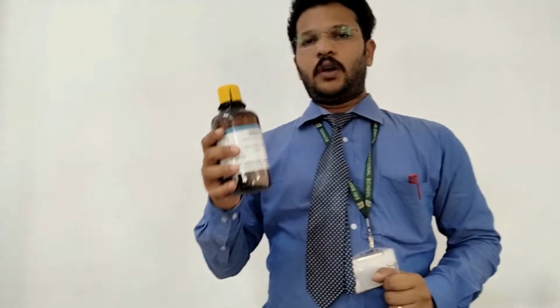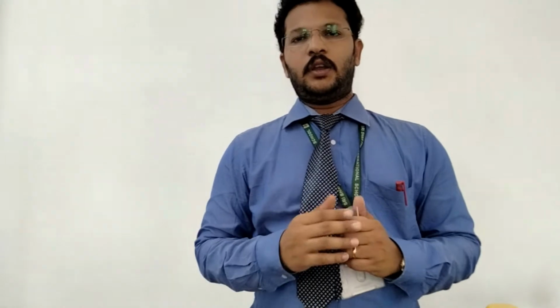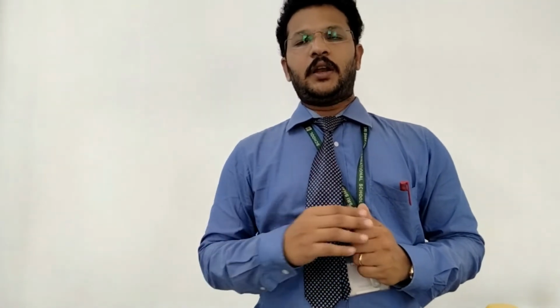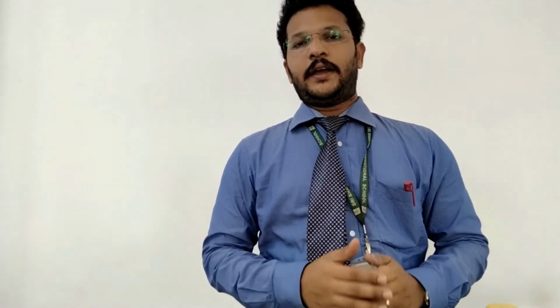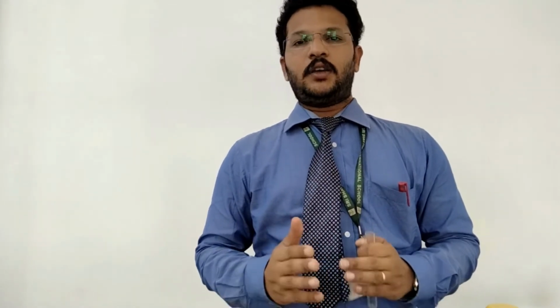In this video, we are going to see the chemical tests for organic acids. Organic acids are usually very weak in nature, unlike mineral acids. They will not readily react, but organic acids will respond to certain reactions. Here we are going to check the chemical tests for organic acids.